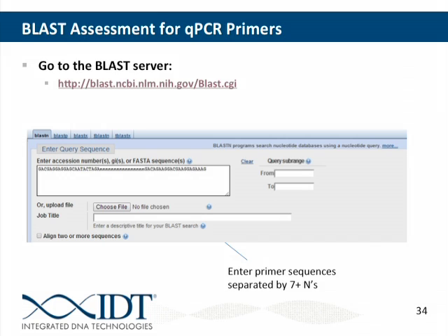And so the best way to do this is to input your primer sequences into BLAST, separating your forward and reverse primer by several Ns. Such as this.